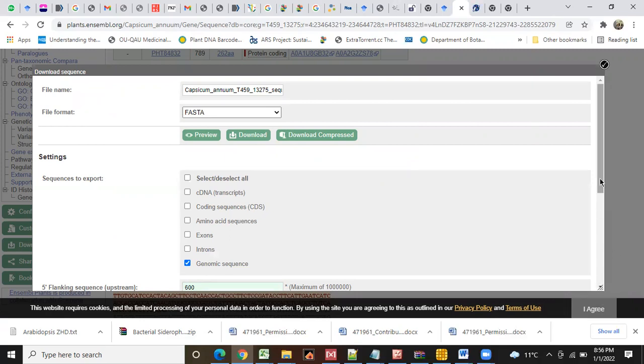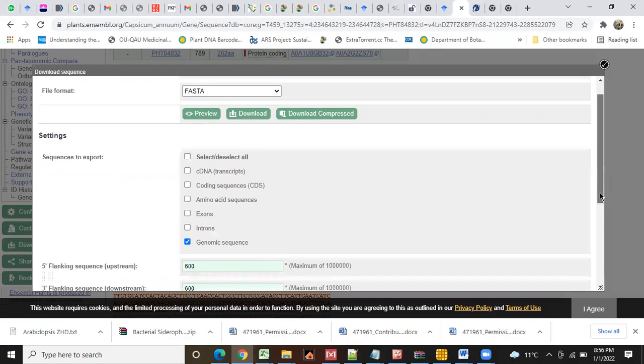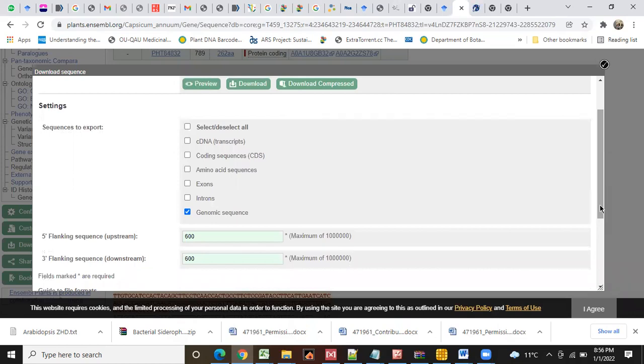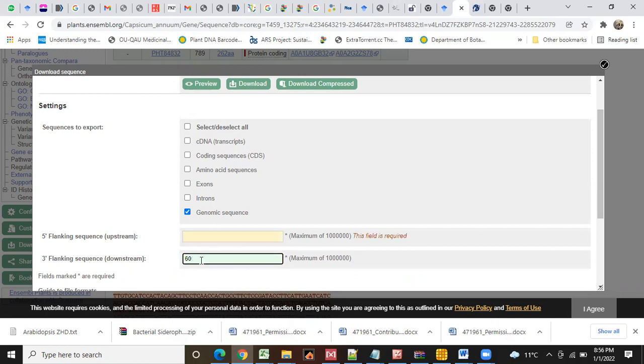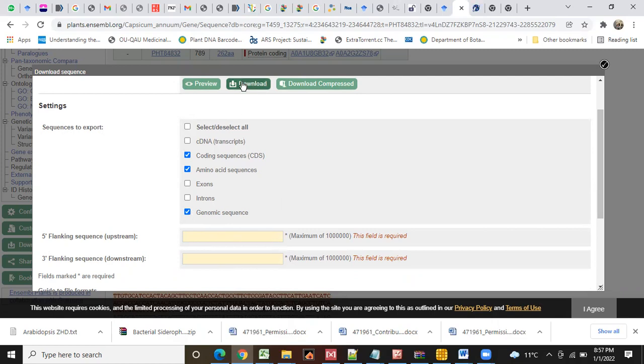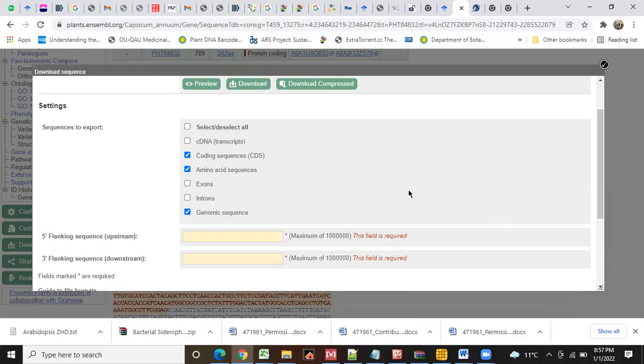First of all, you will download only three sequences. Here you will zero this - no, no, 600. You will click on the CDS sequence and you will click on the amino acid sequence and you will click on the genomic sequence. Then you will download these sequences.